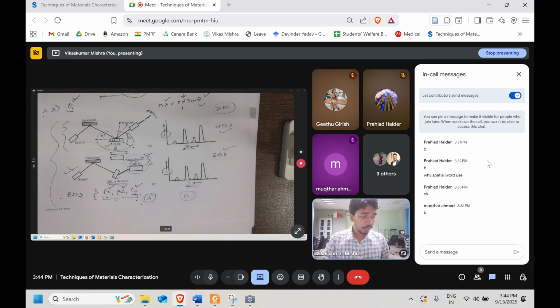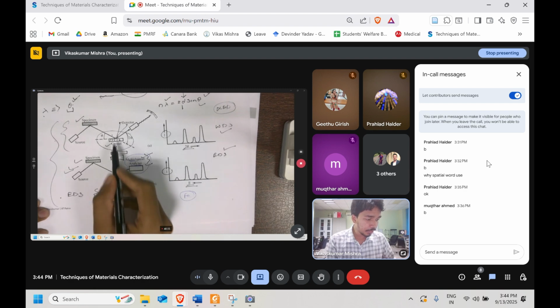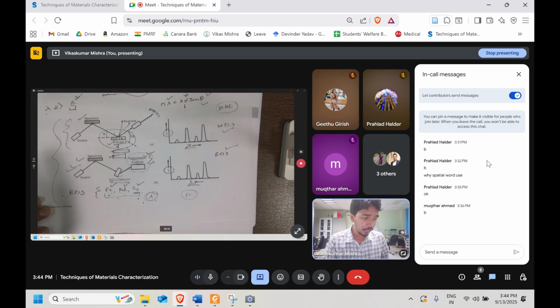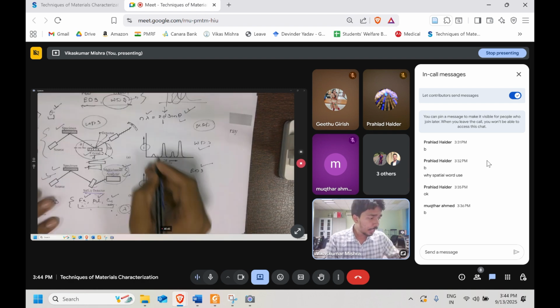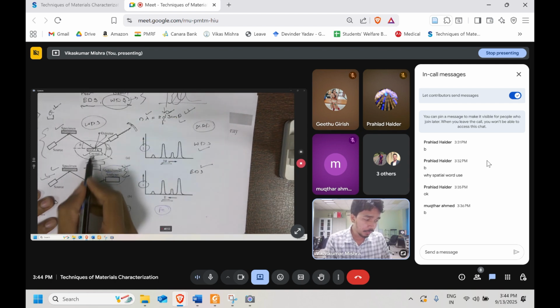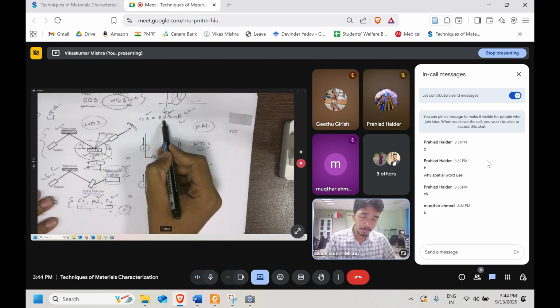Okay. So this is more precise compared to this. Here we are adding multiple detectors. Sorry, not detectors, the number of crystals that we are adding is more over here in the case of WDS, because we know that n lambda equals 2d sin theta. For a different d spacing, one can add different crystals, like if you have 3 or 4 crystals, your d spacing will differ.